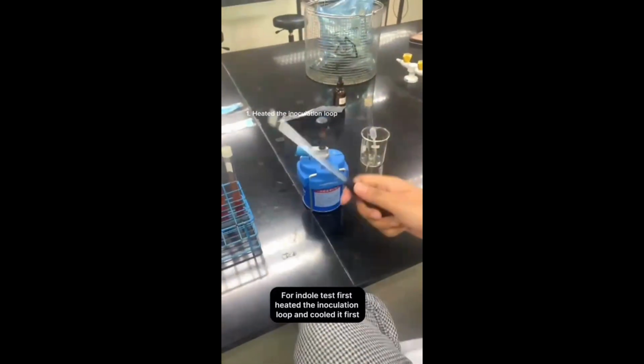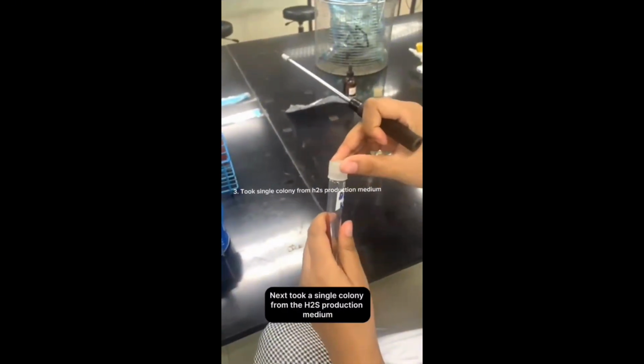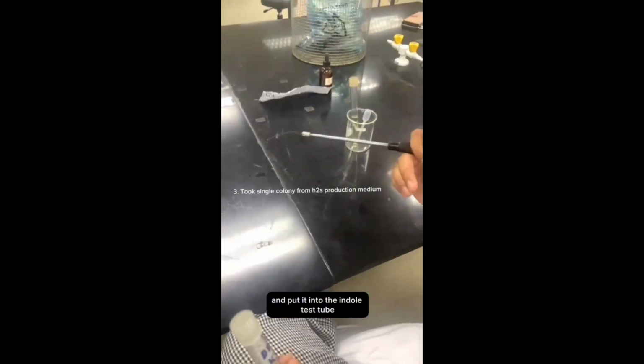For the indole test, first heat the inoculation loop and cool it first. Next, take a single colony from the H2S production medium and put it into the indole test tube.